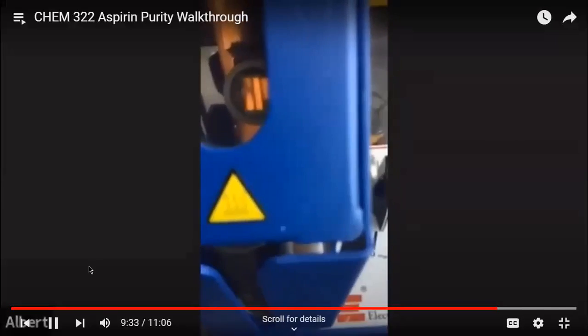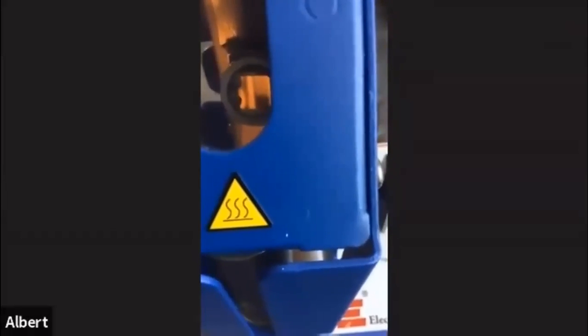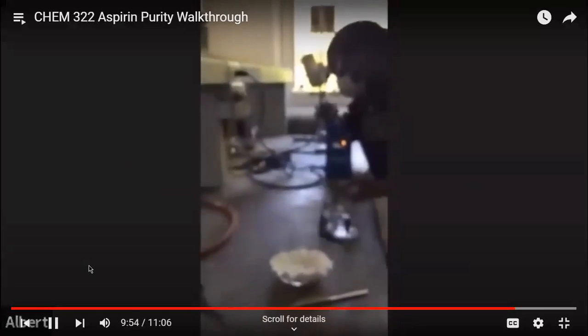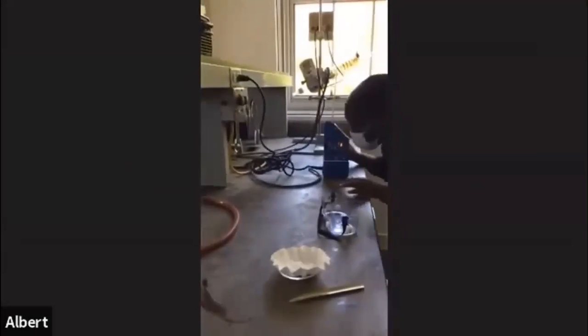Can y'all see that sample, that tube that's in there? Can you lift up on that a little bit just to see if I can see it moving in the cameras? Yeah, there you go. Can y'all see that? Yeah. Okay, that's one sample. So we're going to load the other 2 samples in, and then we're going to ramp that temperature up, and when it starts melting, we're going to ramp the temperature down and slow the heating down so we can get a good, accurate melting point, right?